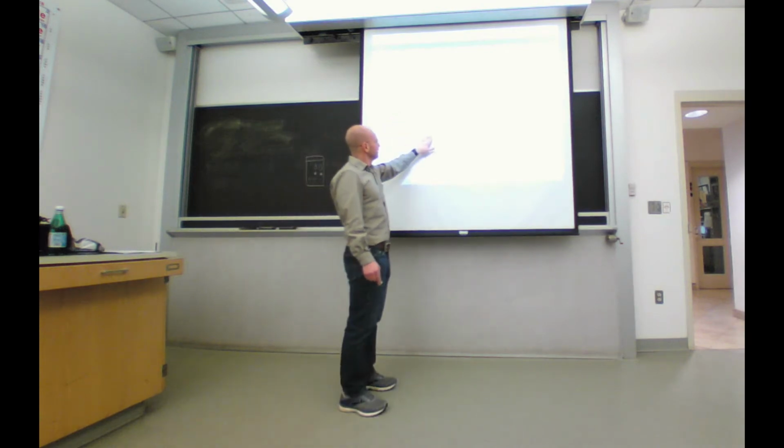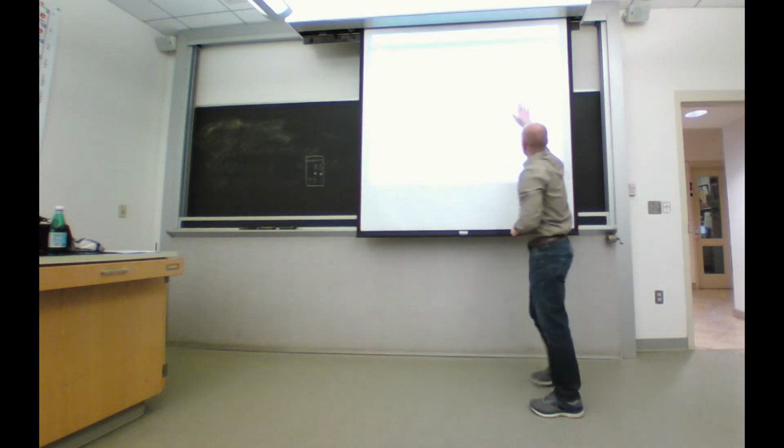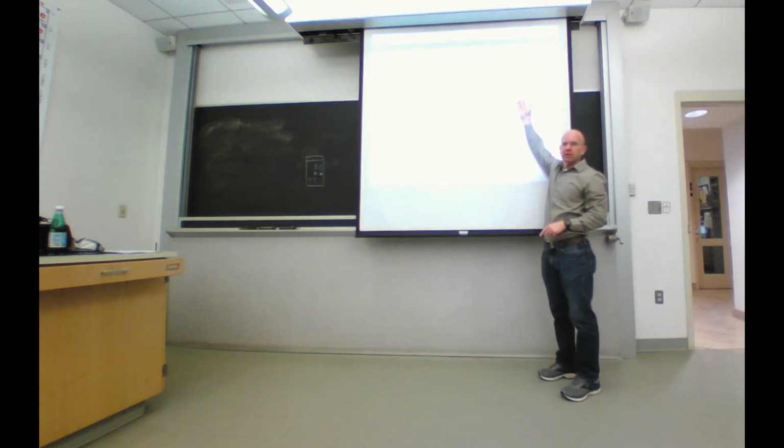So we have something that's UV active, a starting material, that goes to something that's not UV active but stains, and then when the second cycle of the reaction occurs, this is our product over here. It's drawn in a different way than we usually draw it, but that's the product, and again, it's UV active. Does everyone see that? It's UV active, and there's a major and a minor depending on the geometry around that double bond, right? But they're both UV active.